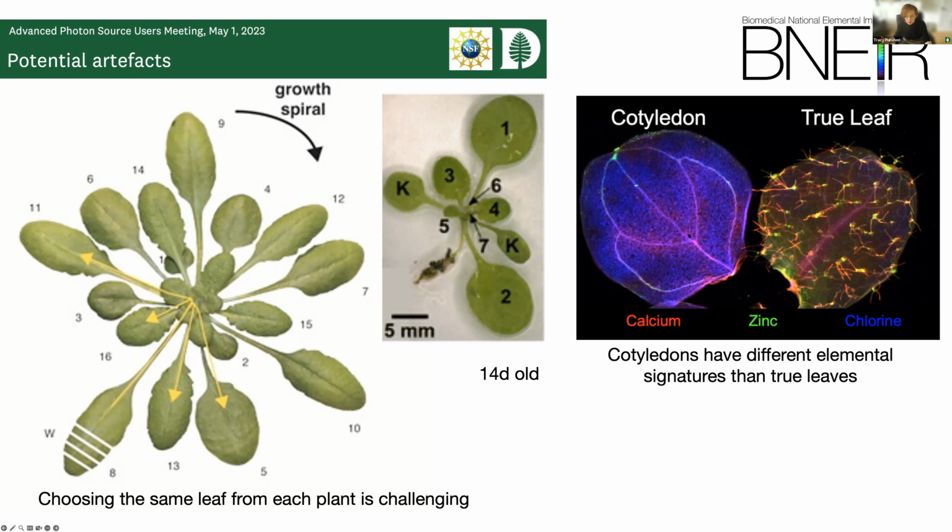It has a completely different chemistry. It doesn't have the cotyledons, these first 2 leaves here. They don't have any leaf hairs at all, which is incredibly important to the calcium regulation in this plant, or so it appears. So they have a completely different distribution of calcium. So we really need to completely change the way we image if we are going to image these fast transient phenotypes that are characteristic of living things.